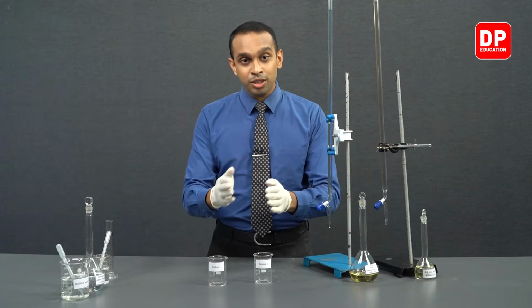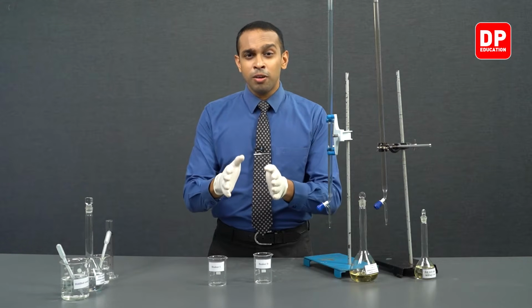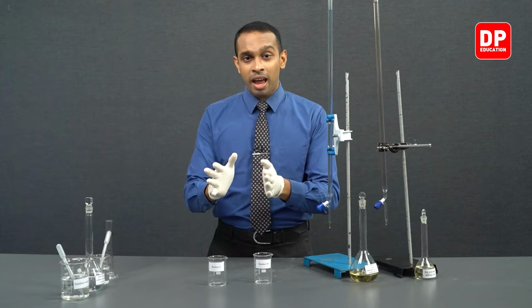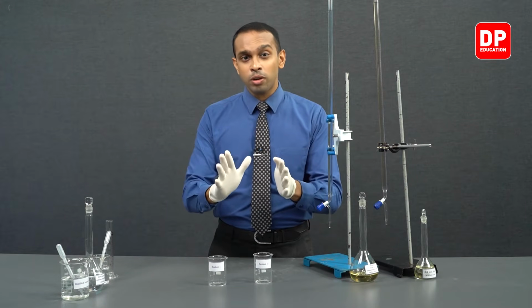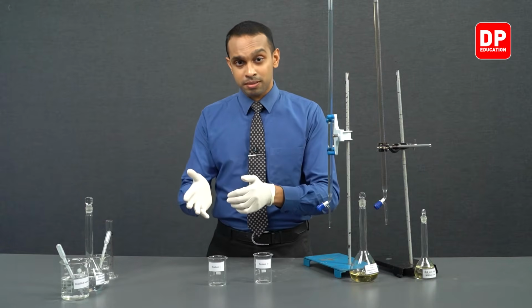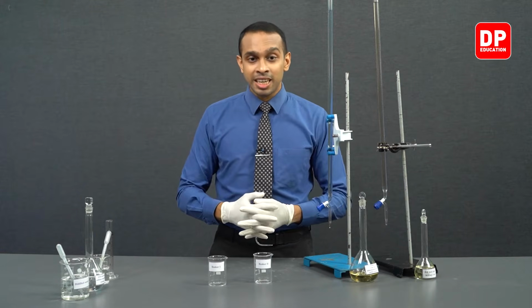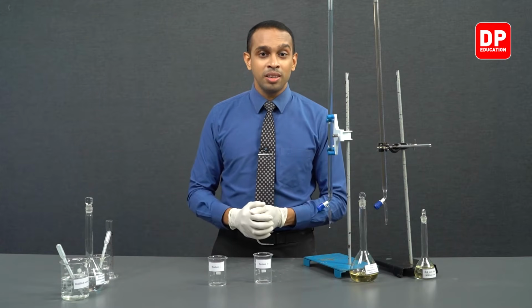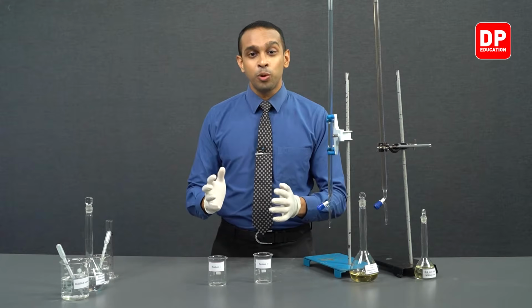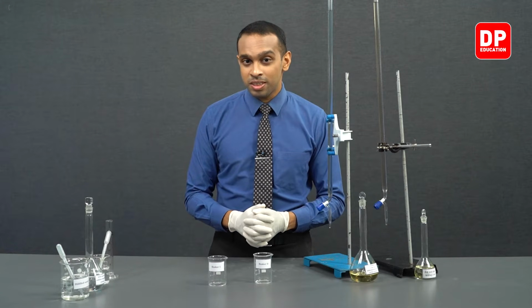So as the main reaction happens, the produced iodine will first have to react with the sodium thiosulfate, and after all of the sodium thiosulfate is reacted in the medium, then the next produced iodine will show a color change. When it reacts with starch, a blue-black color change will be observed.